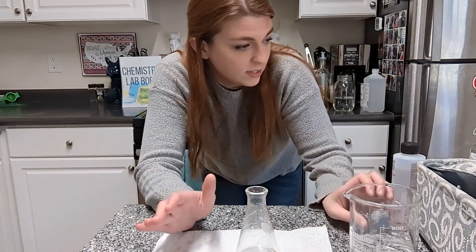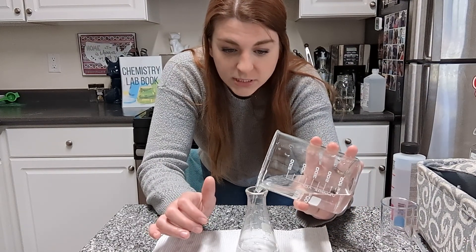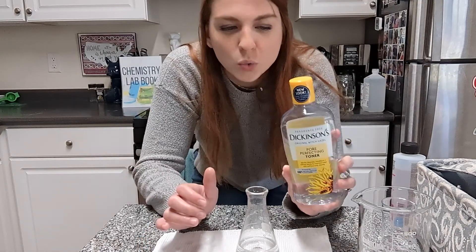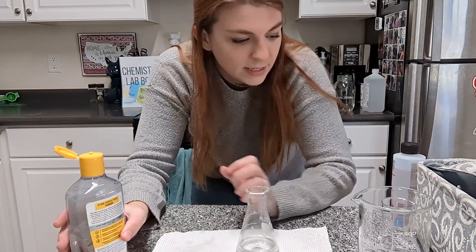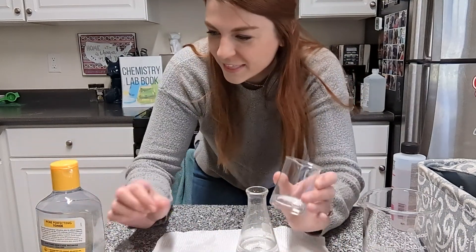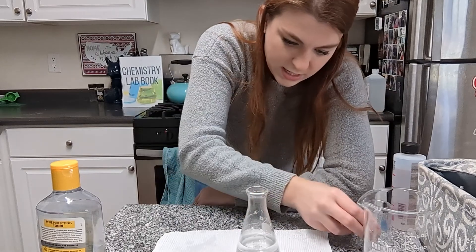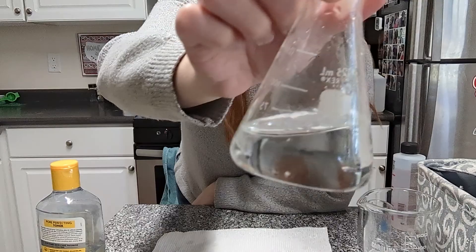Next up, we're going to use some witch hazel, which is a common name for a chemical, but I don't even know what its chemical formula is, so I am going to be surprised by the results same as you. I use this on my face — it's actually a toner that kind of helps to remove oil from your face, so on that alone I think it might be an alcohol-ish type thing. So there's my witch hazel going into the beaker. This is 100% witch hazel — it's not mixed with anything. Beautifully mixed. That is polar.